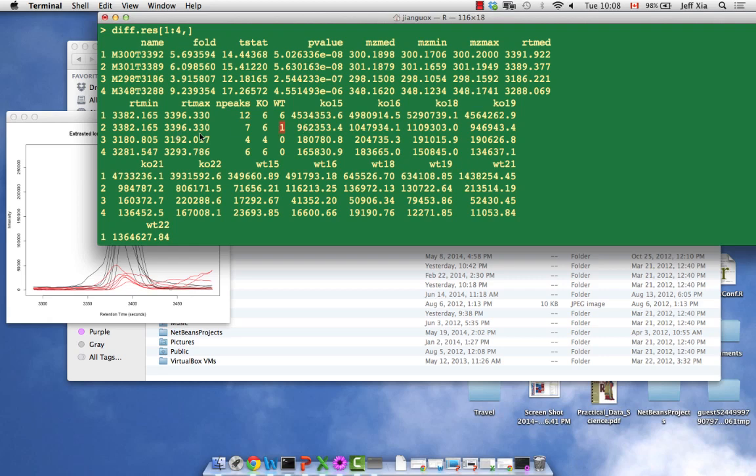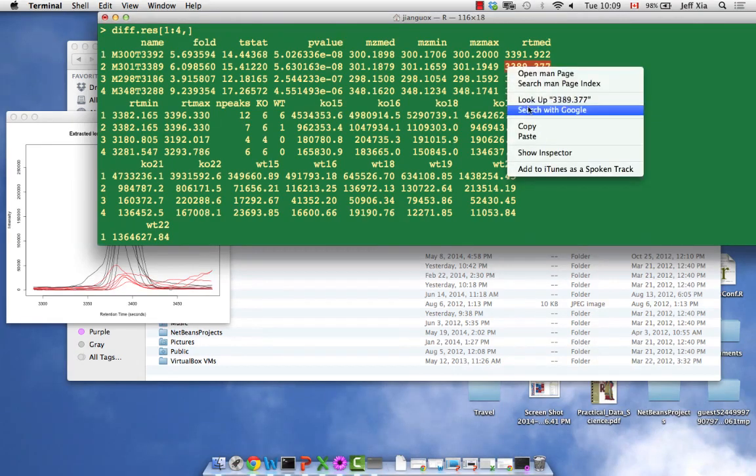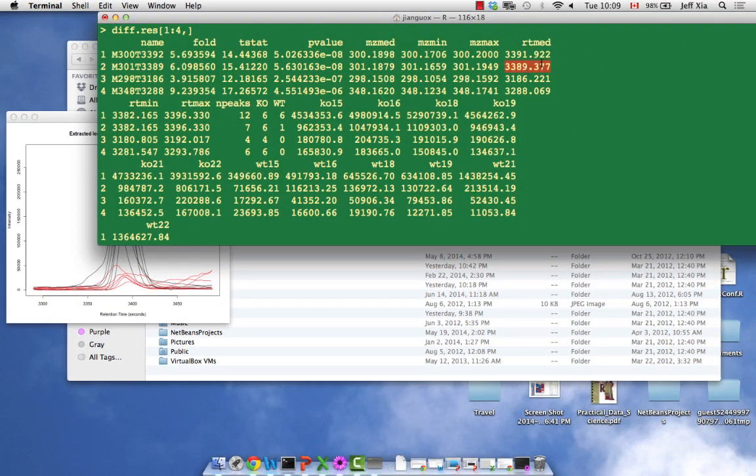Let's visualize it. How to visualize this, we need to... This is the same retention time, different mass. Okay, we try to select from here. Can we select directly this one? So this is unique. Let's try this one. We want to select their median retention index equal to this value, because this seems different from the first one. This is median retention time.